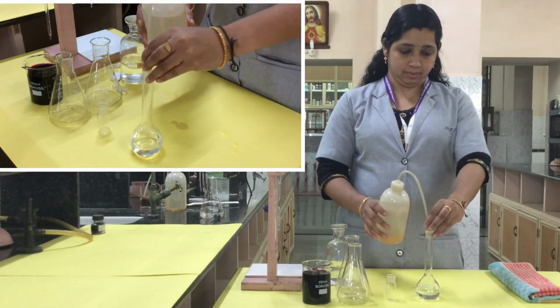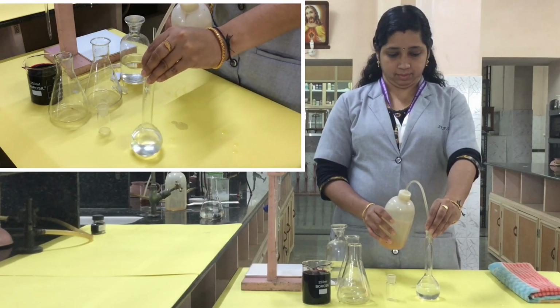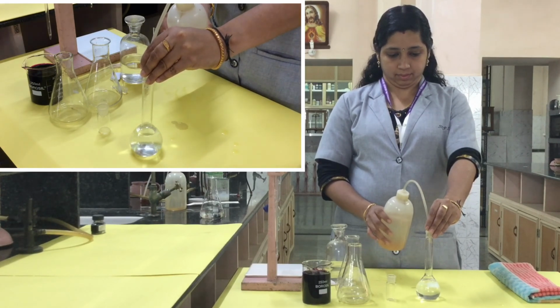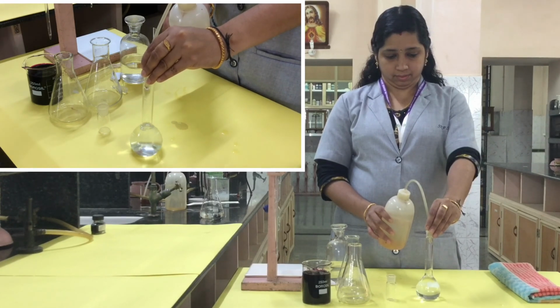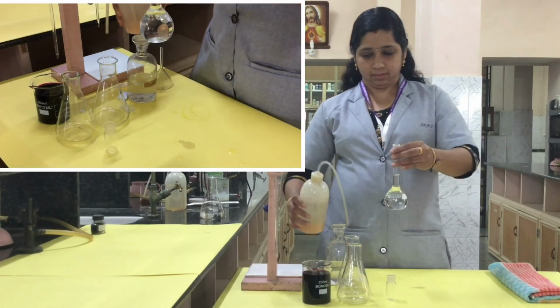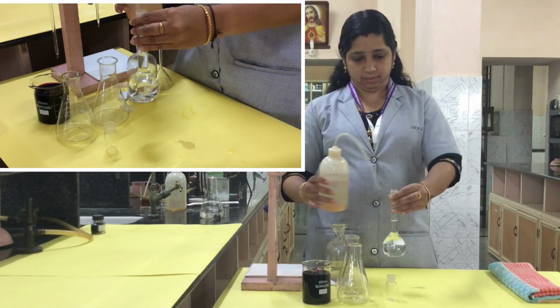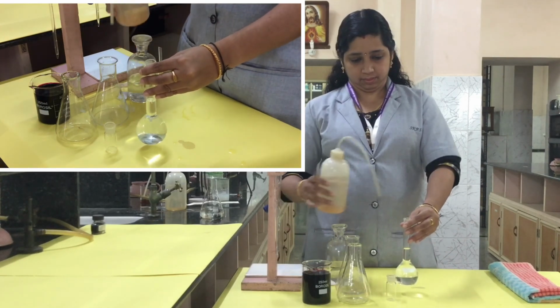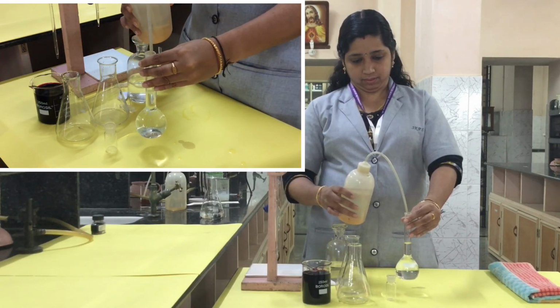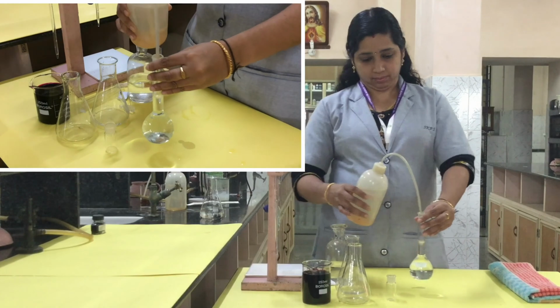Now you have to make up the solution. This is a 100 ml standard flask. You can see the marking there. That is the 100 ml solution. So you have to make up to the mark. Carefully make up to the mark. Then add dropwise. Just near to the line, add drop by drop. One or two drops is required.